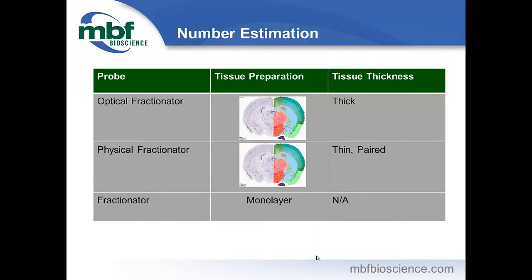The answer is absolutely. When you have a biopsy, you have that opportunity to create isotropic sections, very straightforward, because you already have a piece of your tissue. And so in that case, you could achieve sampling isotropy pretty easily by just isotropically sectioning your biopsy sample.